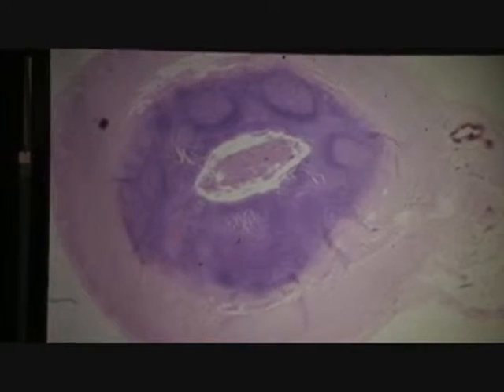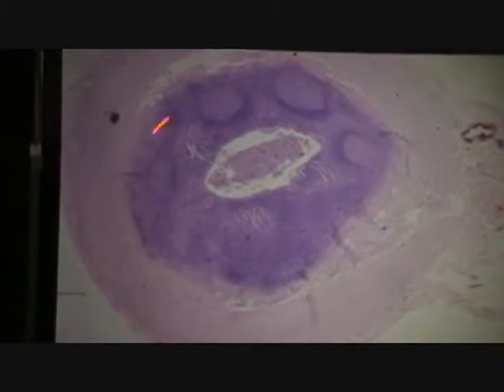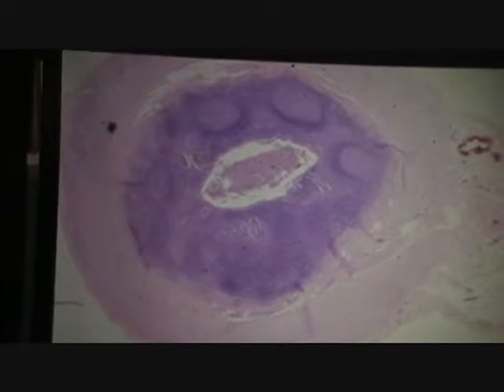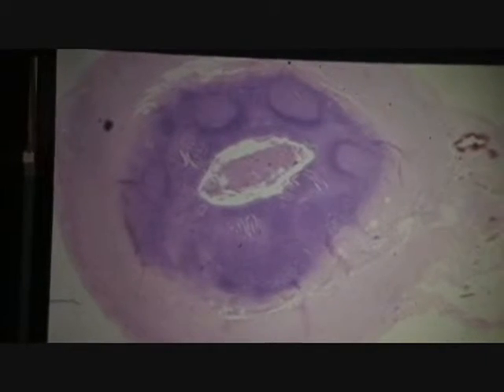Just remember the appendix as a lymphatic structure. All of this is lymphatic tissue in a cross-section of the appendix. And that will just serve you well as a professional in your careers.